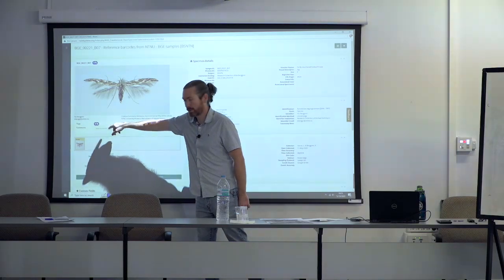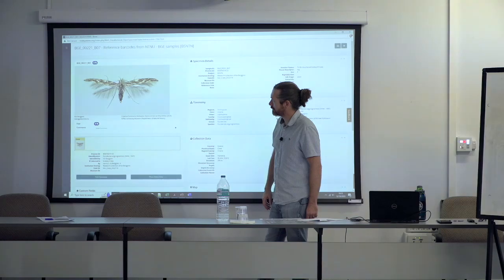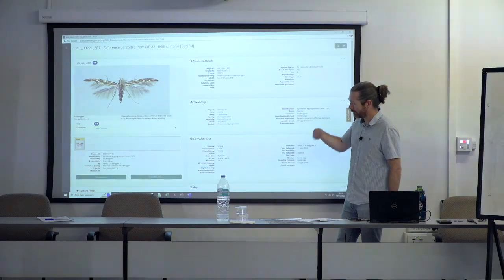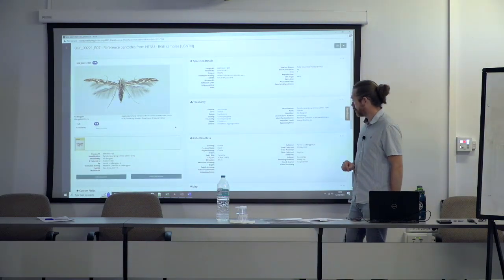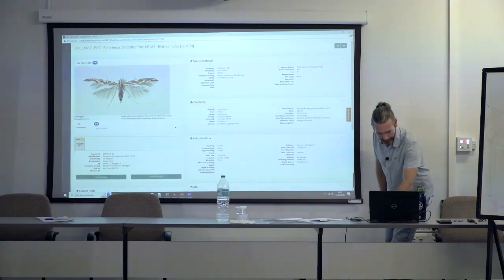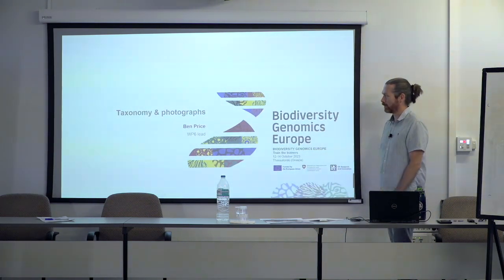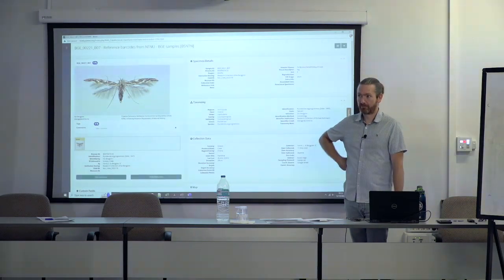You can go and tag it because you're logged in, and say something like, that's not a moth, for example, whatever you want to say. But yeah, this is also editable. So if you are the owner of this record, you can go in there and edit the specimen individually, or you can do batch edits through the spreadsheet, as I mentioned. And that was a much faster version 2 of Ben. So there's time for lots of questions if you want to talk about BOLD upload. Thank you.